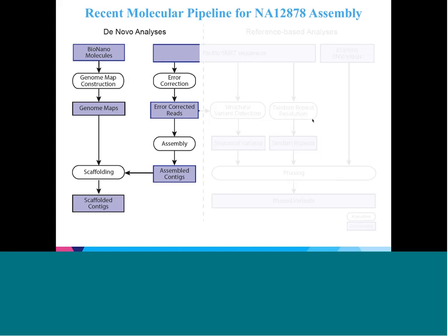The long-read assemblies consist of the updated version of the Celera assembly pipeline, developed by Sergey Koren and Adam Phillippy's group, as well as a modification of Jason Chin's string graph assembly pipeline. It seems a little bit convoluted to use multiple assembly algorithms, but I'll come back later to why that ends up being useful to us, and how it can be useful further on for diploid assembly applications. The output of this is assembled contigs that are going to be passed towards scaffolding.